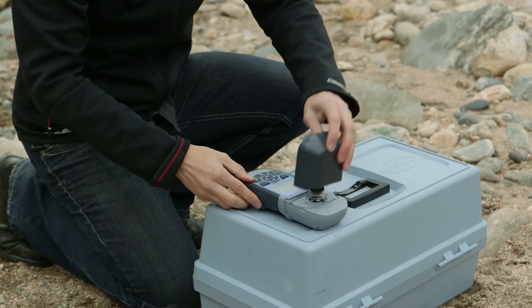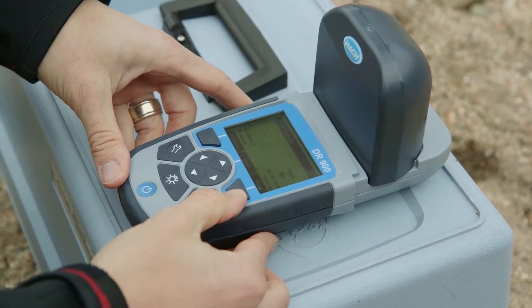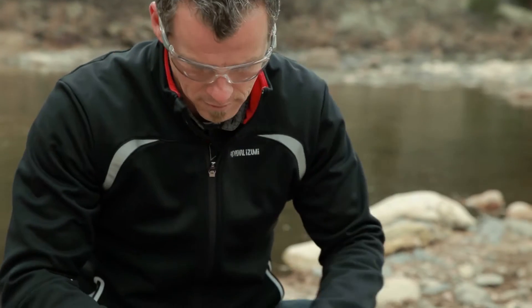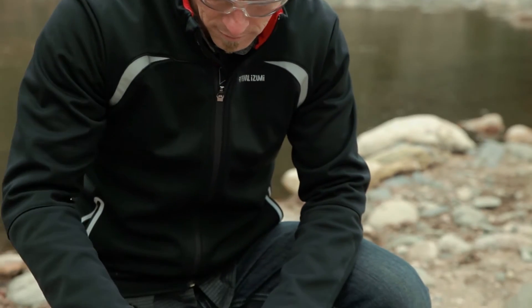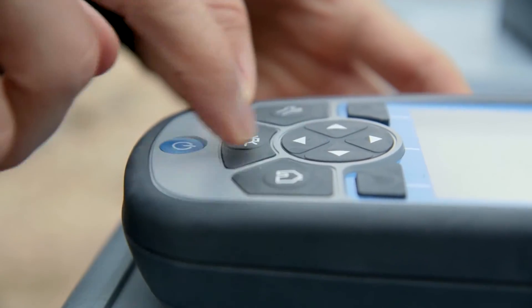What does ideal look like in the field? Something that allows you to test your most common parameters quickly. Ideal is equipment protected against the elements. Ideal means you test easily and have confidence in the data without transcription errors.